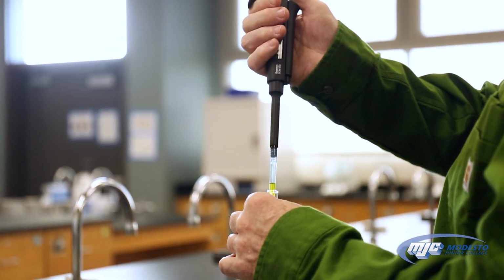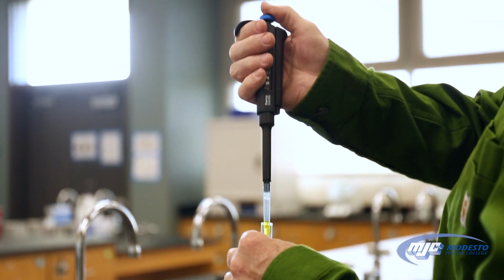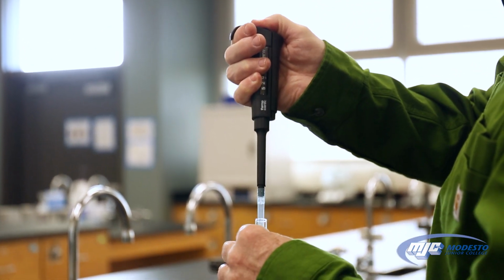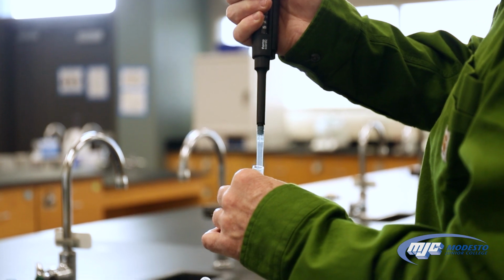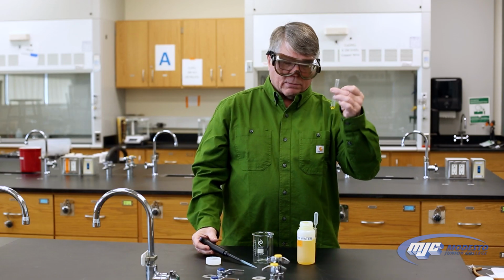Now we put the tip into there, depress the plunger to the second stop, so this time all the way down, boom, just like that. Maybe a couple times to make sure it's all out. Touch the tip to the side of the container, and you're finished.